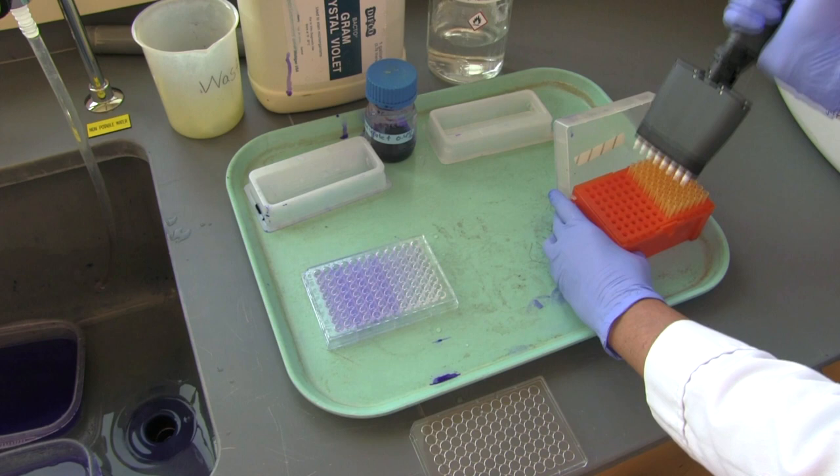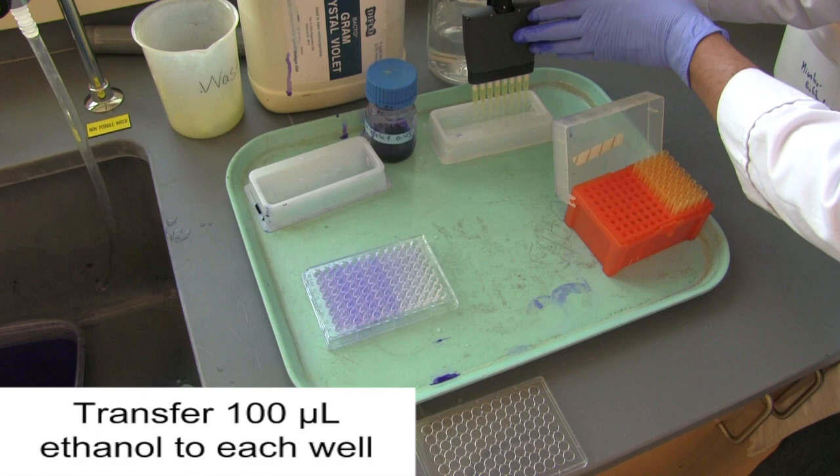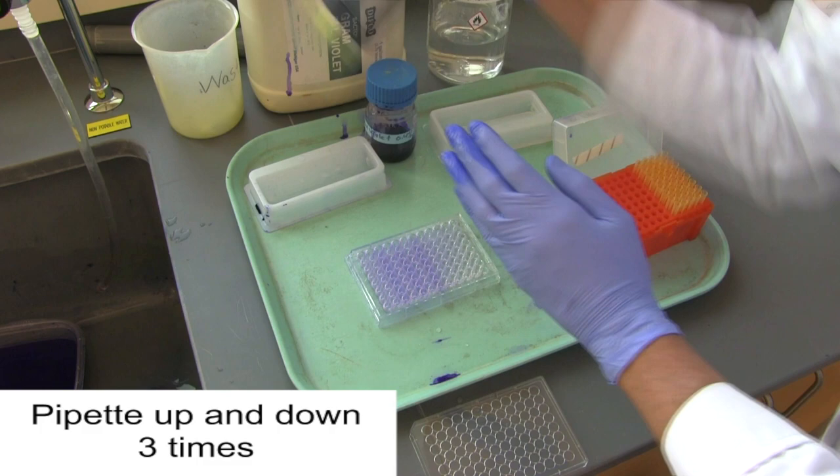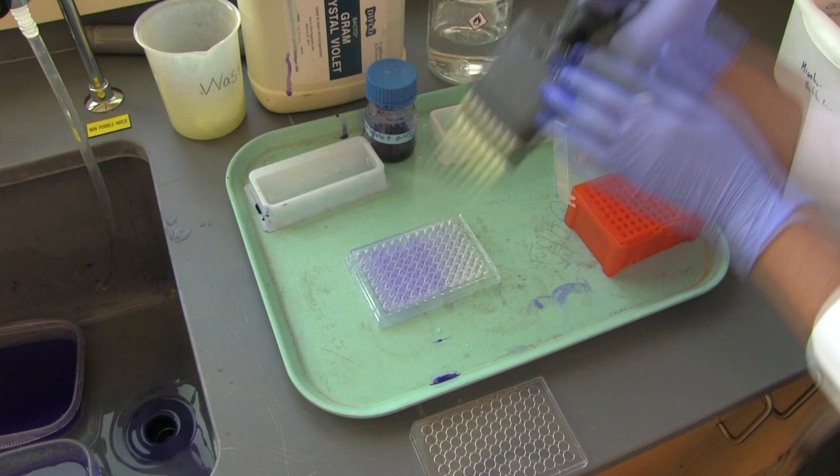Set your pipette to 100 microliters and pick up eight tips. Transfer 100 microliters of ethanol into each well. This time, pipette up and down three times to help solubilize those cells in the biofilm. And then, after each row, eject the tips and get eight new tips.